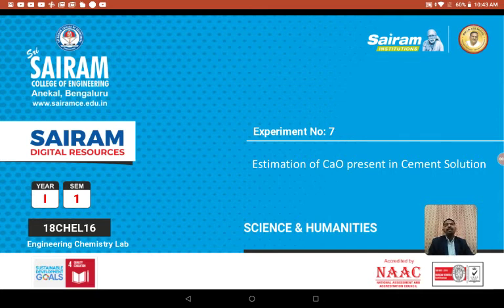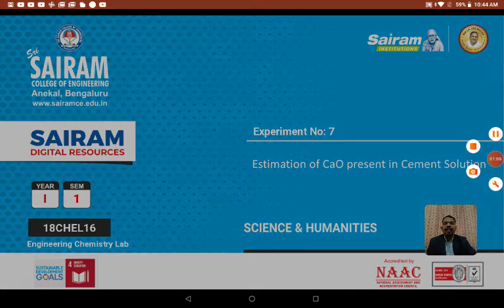So what do we mean by complexometric estimation? In any estimation, if you are using EDTA as the titrant, such estimations are called complexometric estimations. Today, let us see how to estimate calcium oxide using EDTA.